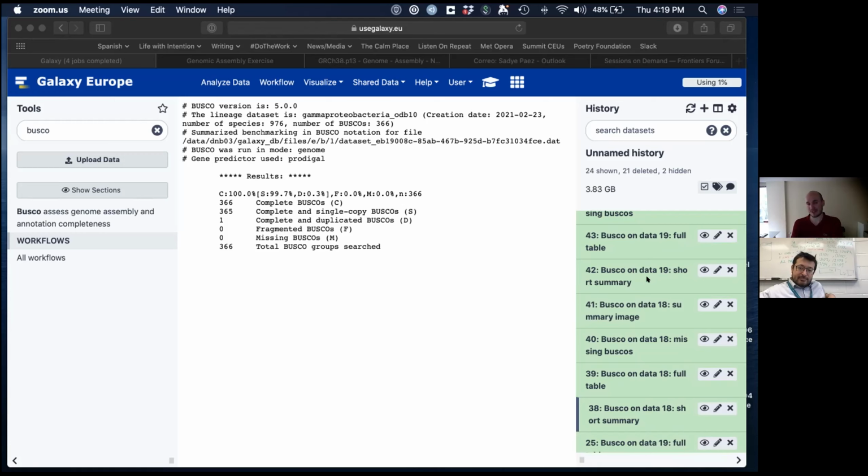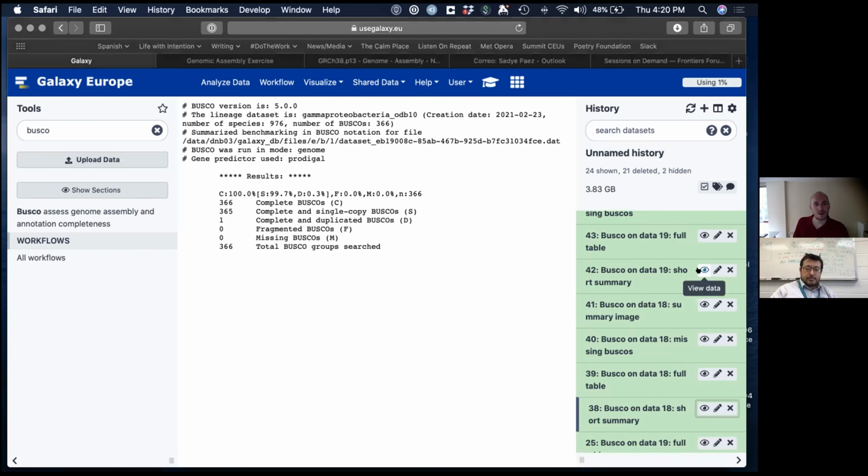And even if you have a metagenomic sample where you had 20 strains, you would get 20 chromosomes assembled separately with HiFi reads at this point. I mean, we could compare this one to the alternate. I ran it as well. Well, the alternate technically is trash here, right? Because E. coli doesn't have an alternate haplotype. But I did it for the sake of exercise. I know it's basically junk, but at least we can see here it has all these missing ones.